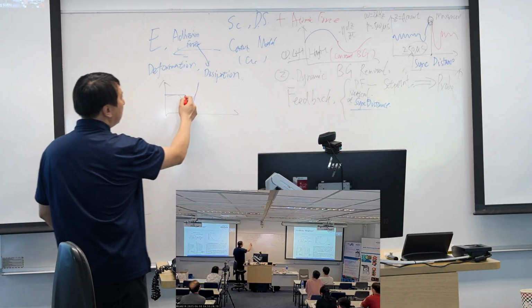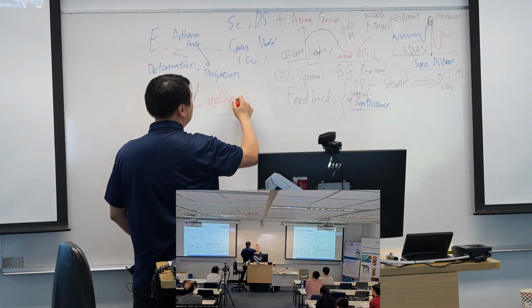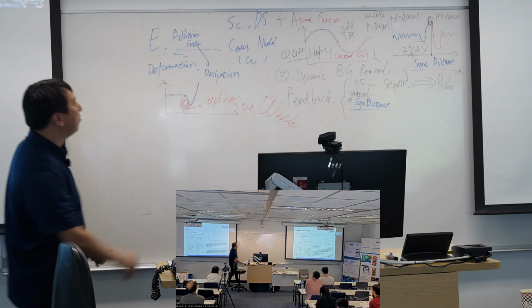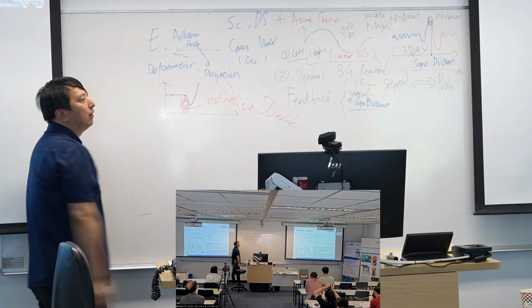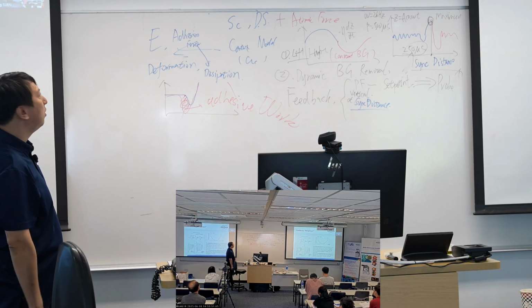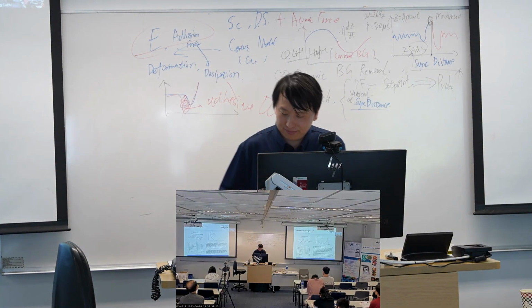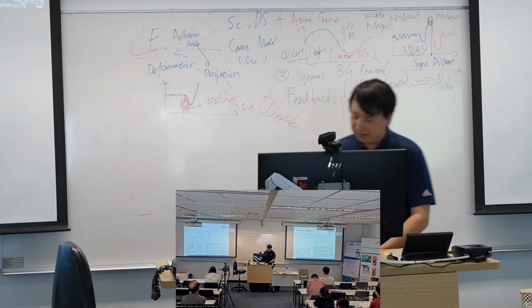We think this one means the so-called adhesive work, and Bruker gave it another name called dissipation. Just the looped area. But usually researchers just take modulus and adhesion force. They don't worry about Bruker's other stuff. Okay, that's our PeakForce tapping.